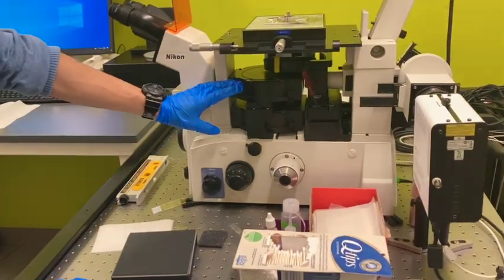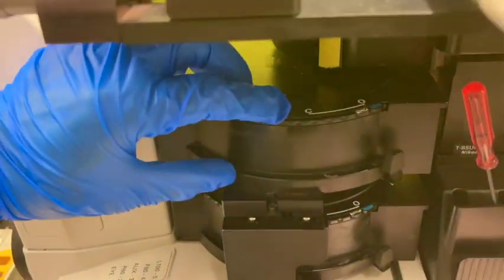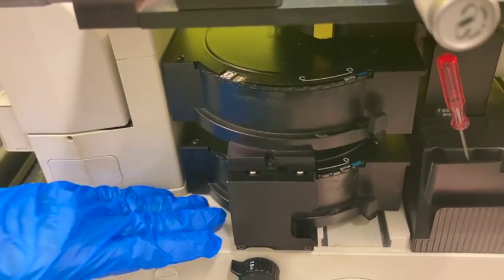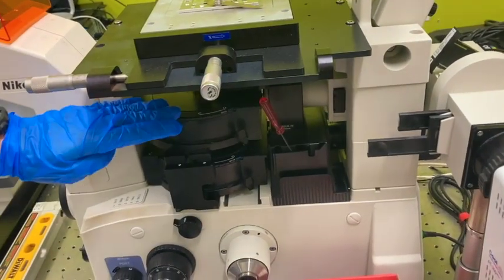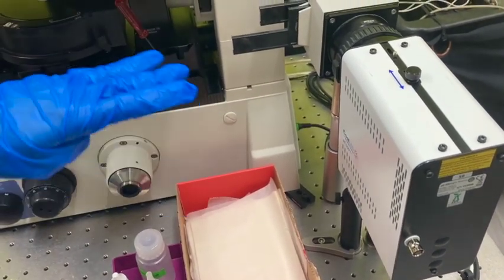And then if we look at the microscope here, we have 2 different turrets. One above here and one bottom. The bottom one is for the TIRF, which is connected to that fiber over there, and this top one is connected to this LED, which is for our epi illumination.